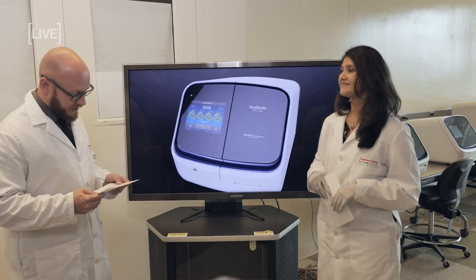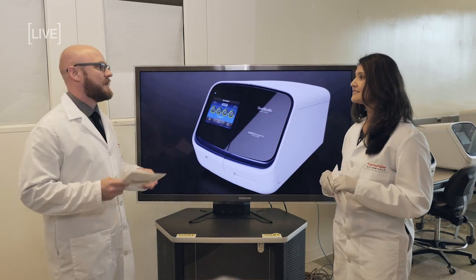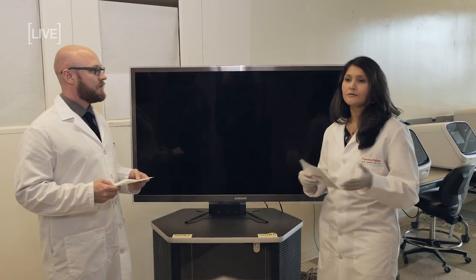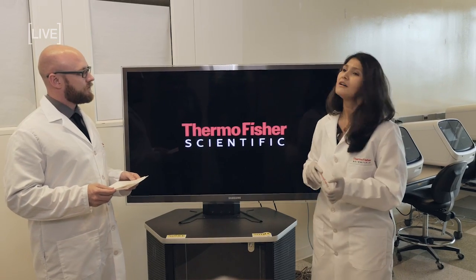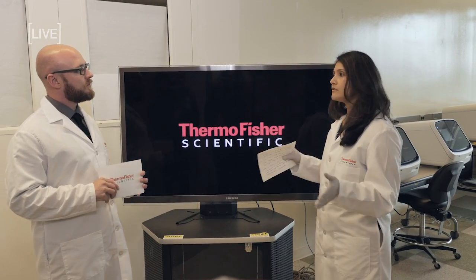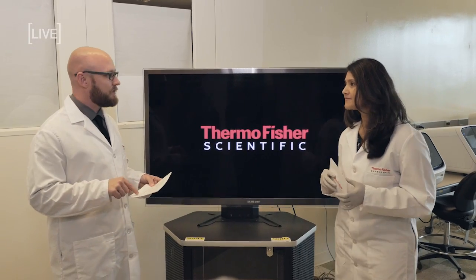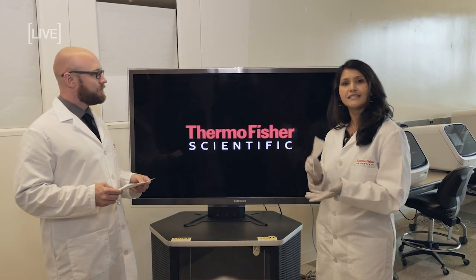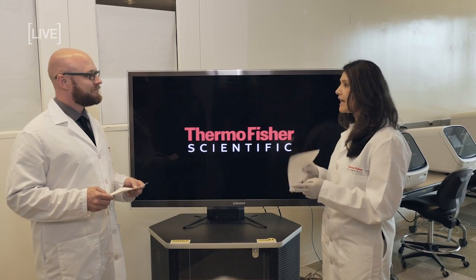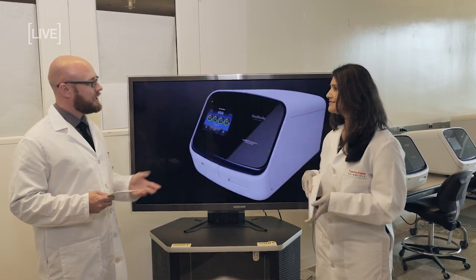Right, okay. Laptop computer hooked up to the SeqStudio system. How optional is that? Well, you do need your laptop for secondary analysis, but it doesn't have to be your own. It can be a shared laptop. But for the instrument itself, you don't need a laptop computer. And then plates, strips, tubes, what's being used on the SeqStudio system? Yeah, you can use a 96-well plate, or you can use the 8-tube strips as well. Pretty flexible. Yeah, awesome.